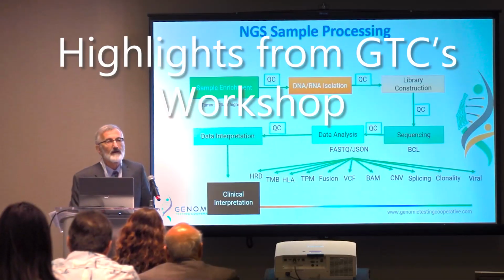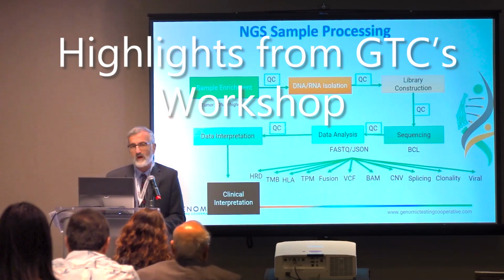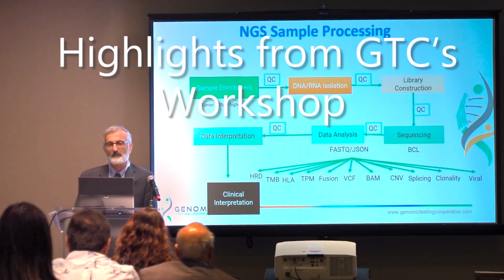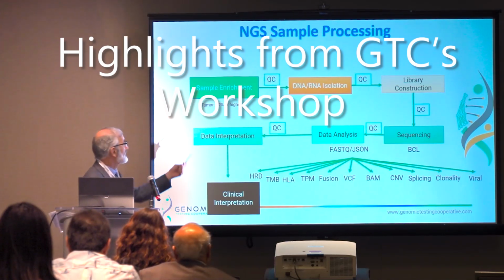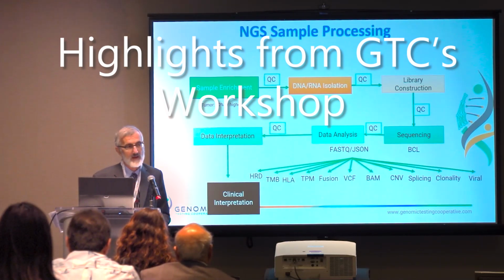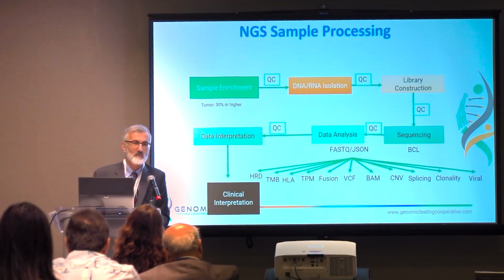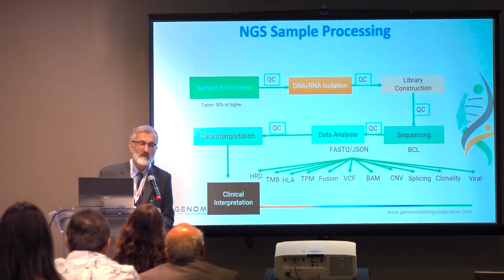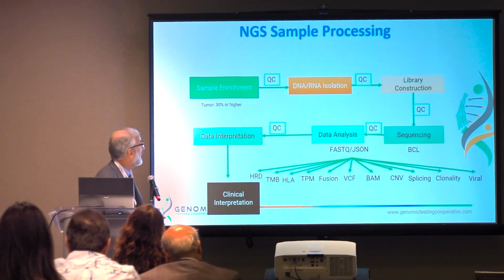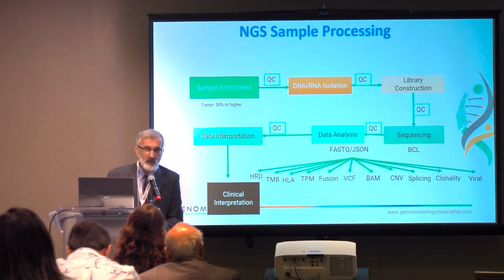Okay, so these are the procedures. You want to really also, all the time, have quality control for every step. So you want to start with your samples. You want to make sure that your samples, in terms of the time when it is obtained, whether it is fresh or if it is FFPE or if it is solid tumor, you want to enrich for your tumor.